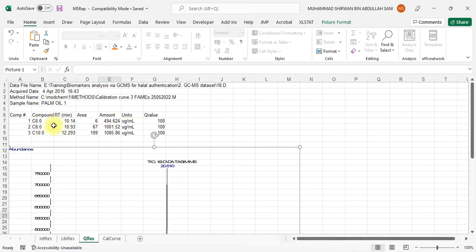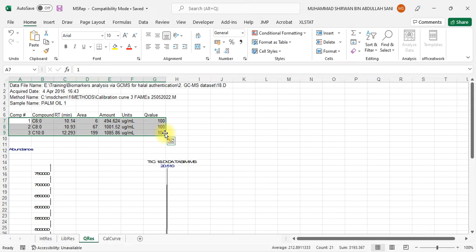So you can see these are the Excel results. So you just copy this one, put in your thesis. We don't do the village way here, we go to a higher level. So that is why I propose to have this kind of workshop. Everybody shall know how to do this one. We have this kind of advanced software, but we still need to do it the old-fashioned way. No, that's not us. Okay?